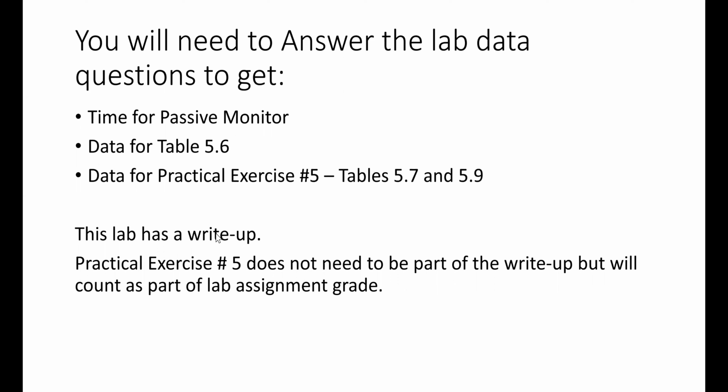Practical exercise 5 is more practice to try to get that gas and vapor combined gas law down a little bit better. You'll get a lab assignment grade for that, along with answering the questions in the back. And you might look at the questions as they apply to the first 4 parts of the lab and what we're doing there, and see if that gives you a hint as to what I need to be putting into the discussion part of my lab. So hopefully that'll help you understand what's going on a little bit better.